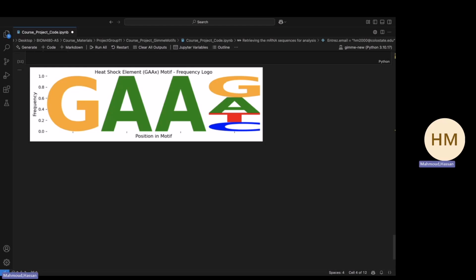And so with all of this, there's a lot of ways in which this script could also be modified or extended, where we could search for longer motif patterns or different patterns in general just within the mRNA sequence. And we could also get some kind of output to match the sequences to a file for further analysis. And we could also transform the count matrix into an information logo, which would help us to highlight which positions are also the most conserved.